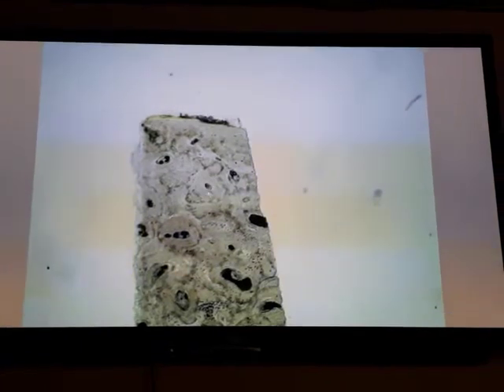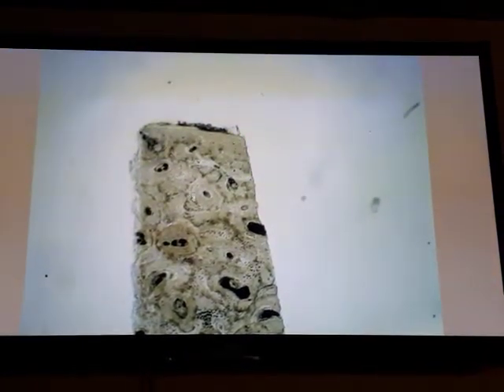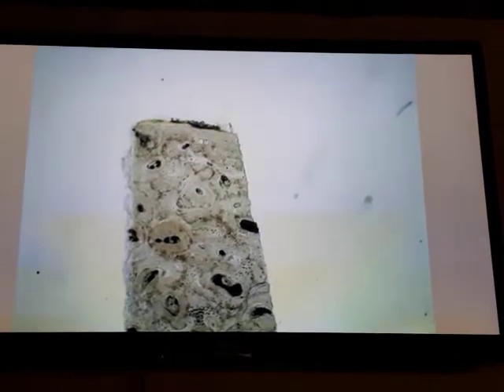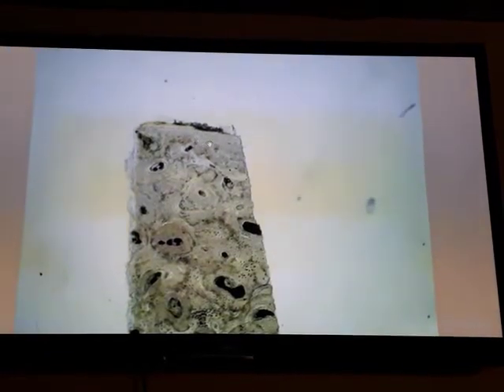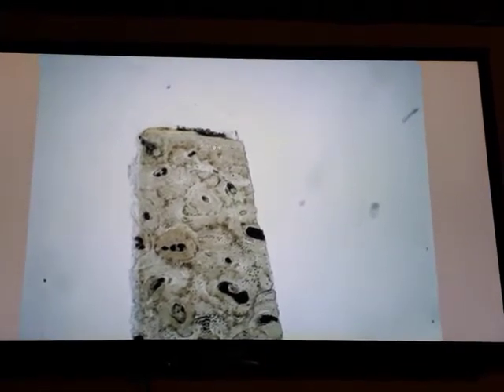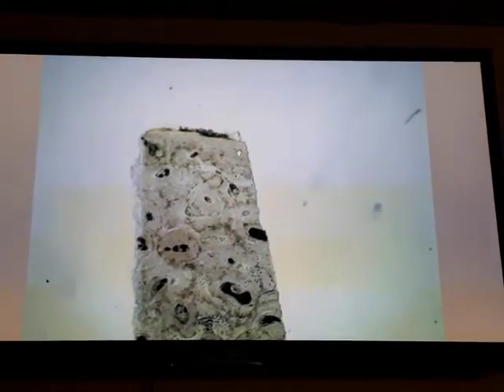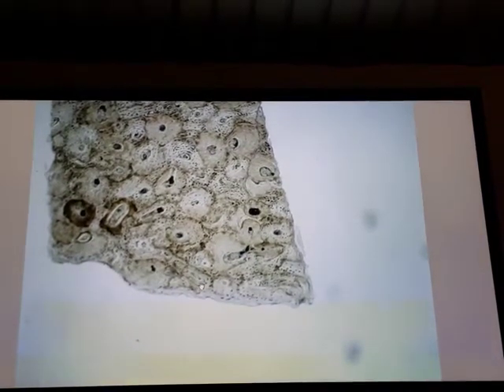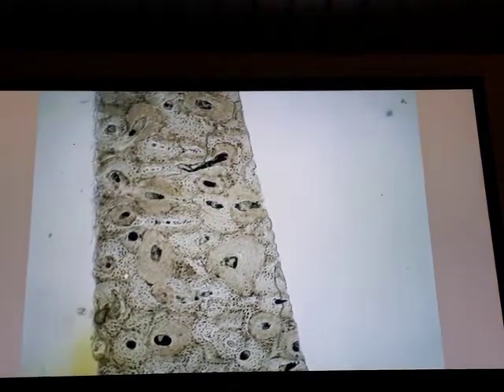The Haversian canal is surrounded by concentric laminae. The laminae located immediately beneath the periosteum are called outer circumferential laminae. Near the endosteum are called inner circumferential laminae. Between these two systems of laminae, we have irregular or triangular-shaped laminae called interstitial or intermediate laminae.